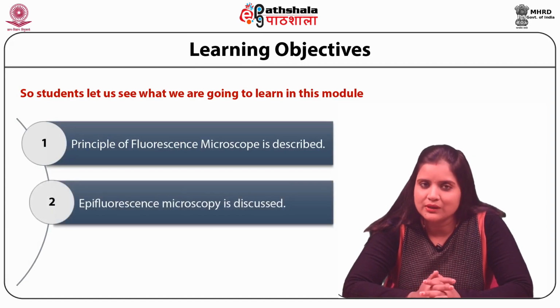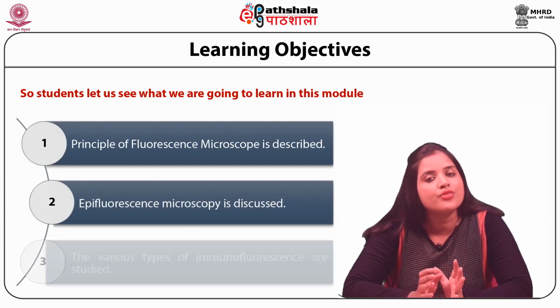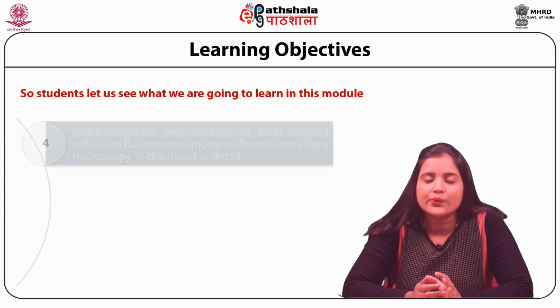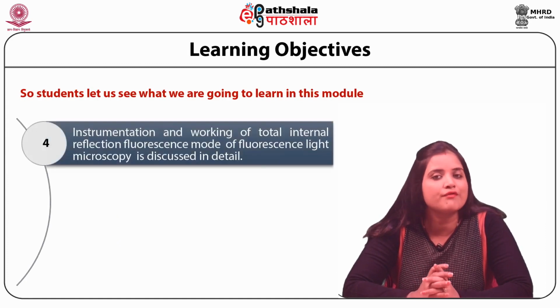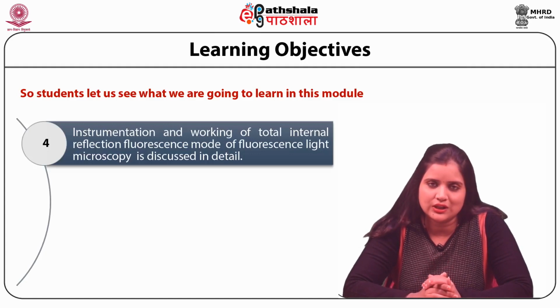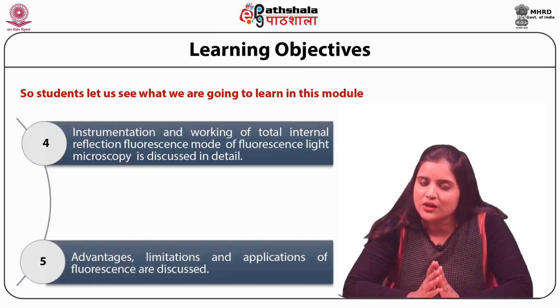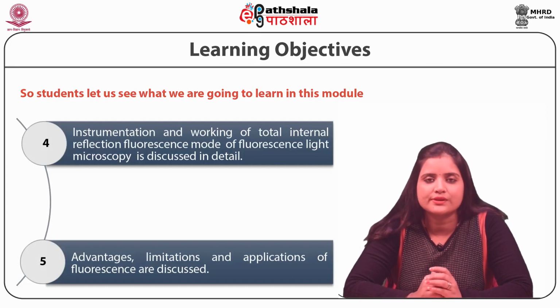Epifluorescence microscopy is discussed in detail. In this module, the various types of immunofluorescence are studied. Also, the instrumentation and working of the total internal reflection fluorescence mode of fluorescence light microscopy is discussed in detail. At the last, we will study the advantages, limitations, and applications of fluorescence.